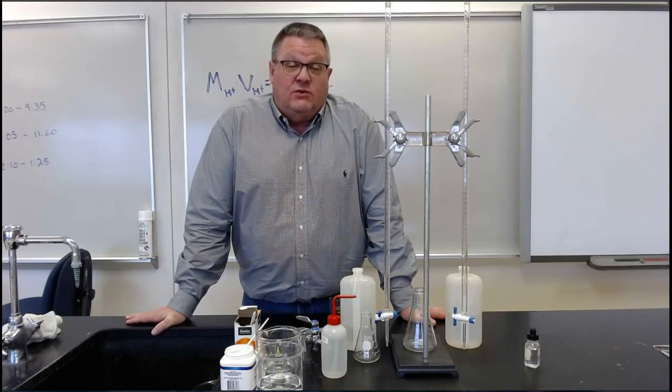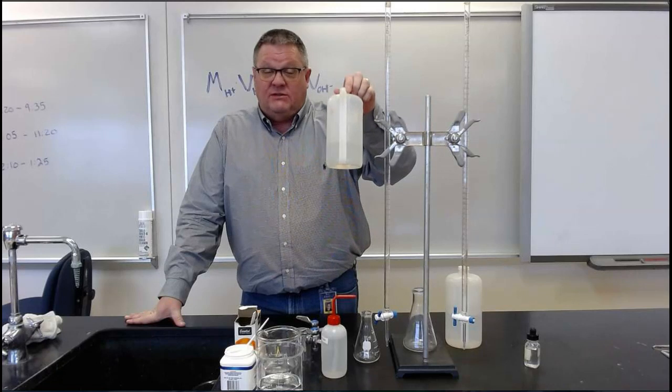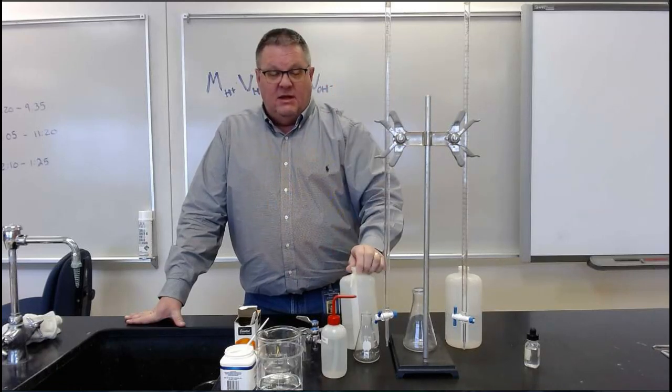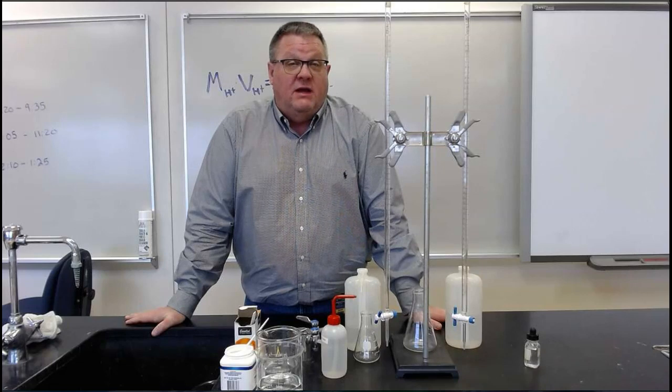The goal of the titration lab is to determine the concentration of an unknown base. This is NaOH, it's a base solution. We need to figure out the molarity of it. We can do that through this process of titration, which is the controlled addition of an acid to a base.